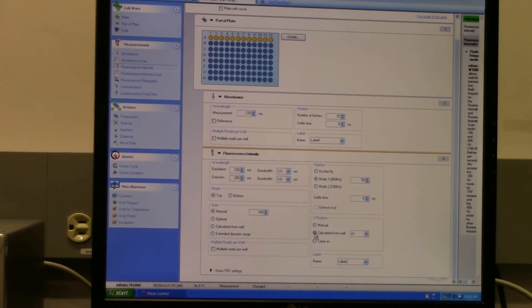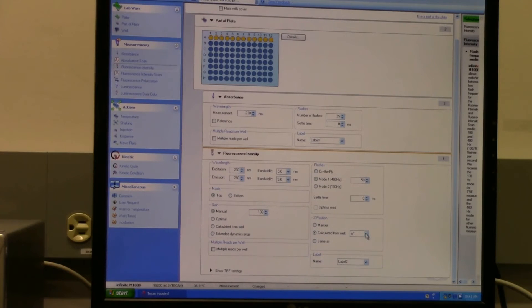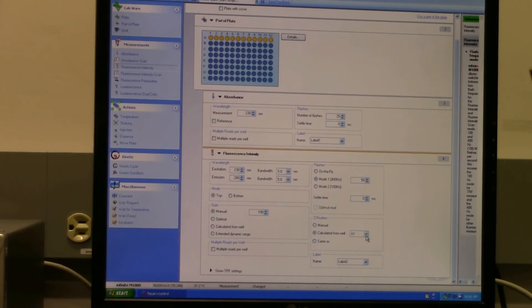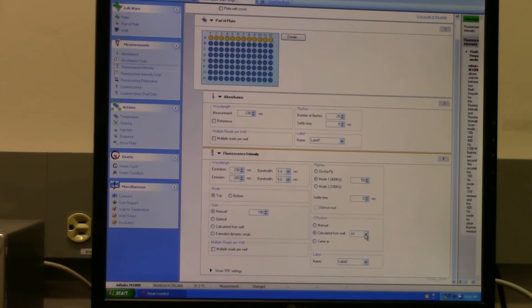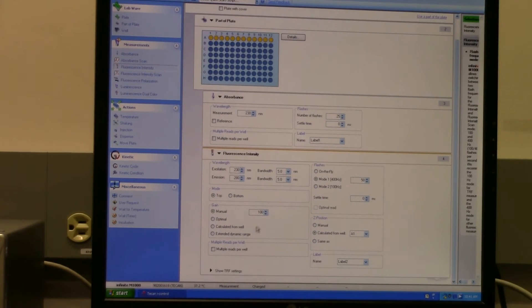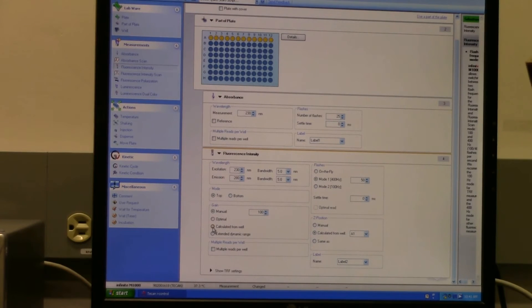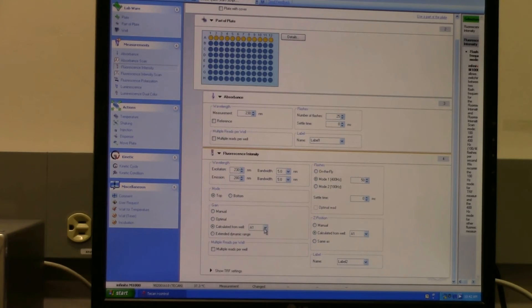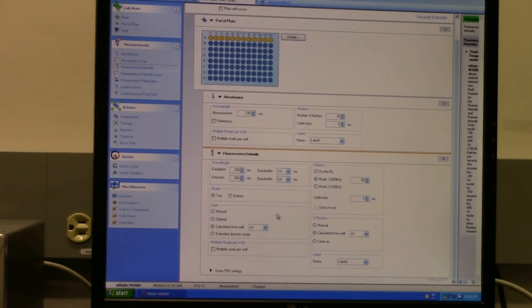So you would just check this here and tell it which well you want to calculate it from. It's probably best to use a well that's maybe not the highest fluorescence, not the lowest, but somewhere in between so that it will get you the right Z position. And the same with the gain is another thing I recommend that you actually ask the instrument - this is the first time you do the assay - you ask the instrument to calculate it from the well. And again, you choose a well that has an intermediate fluorescence so that you won't get saturation when you're doing your reads.